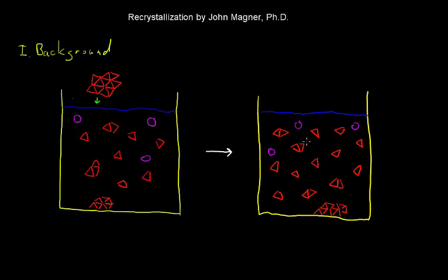And one way to think about this is that solute particles have a given shape that pack very nicely into a crystal. They tend to exclude molecules that do not have the same shapes and interactions. And so as the recrystallization occurs, the impurities are excluded from the growing crystal as these things begin to agglomerate and precipitate out.